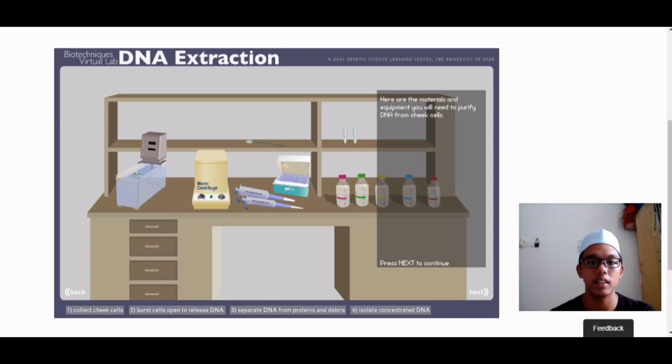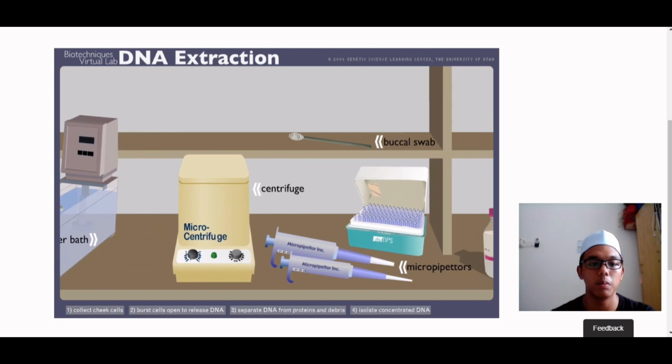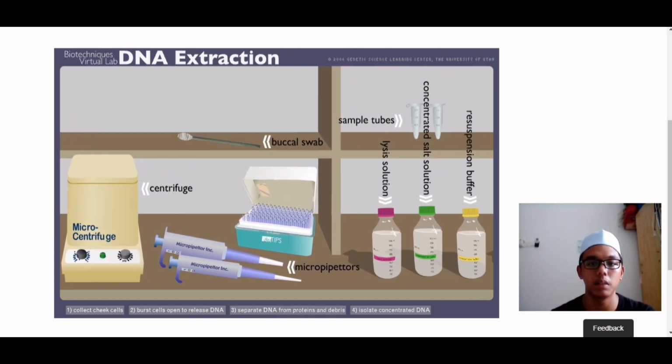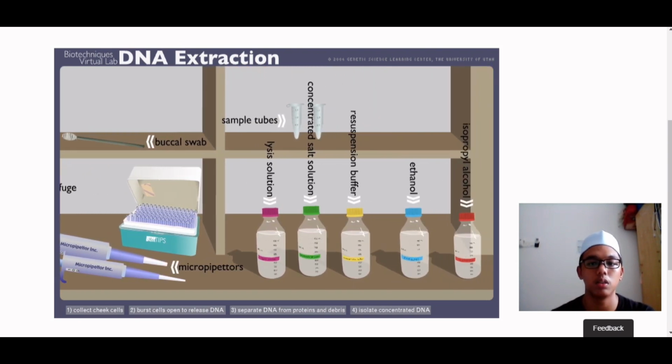Here we can see the material and equipment we will use: water bath, microcentrifuge, buccal swab, micropipettes, and sample tubes. And we have 5 solutions.